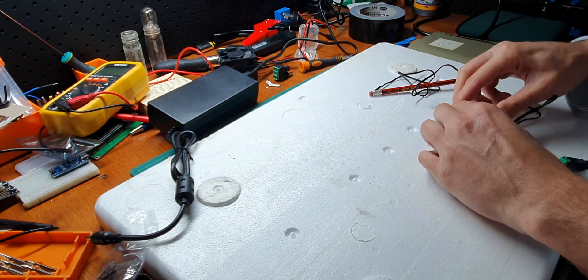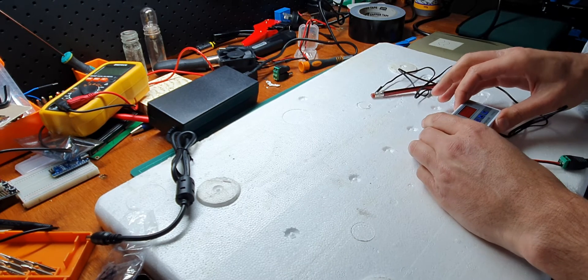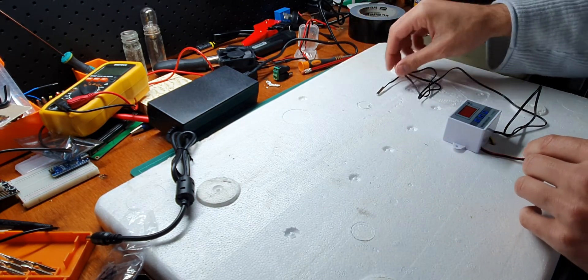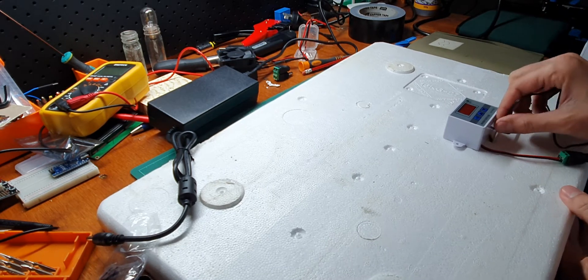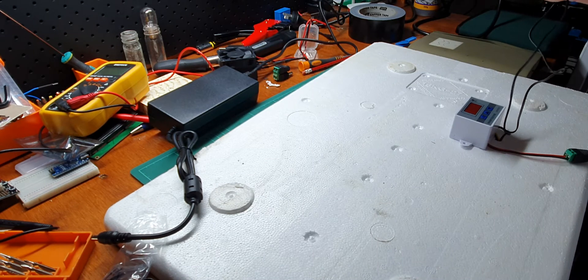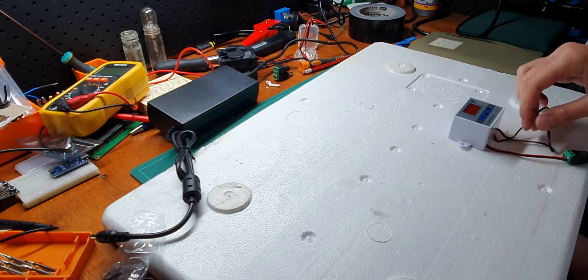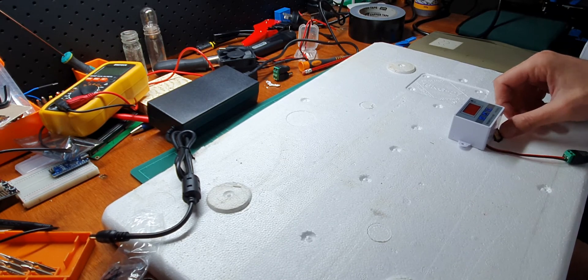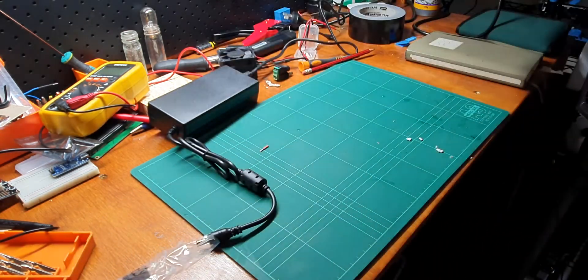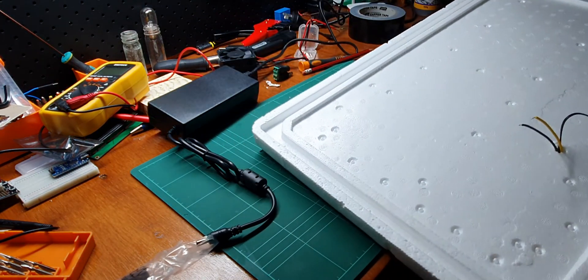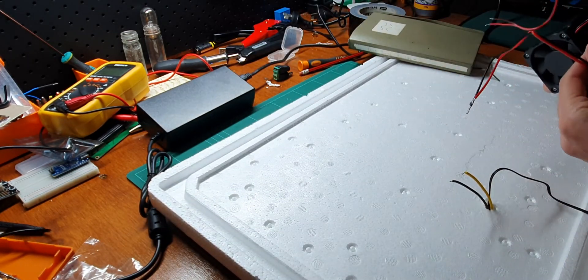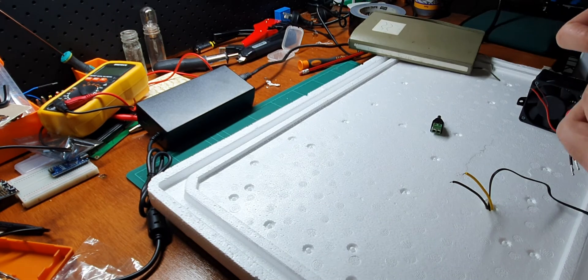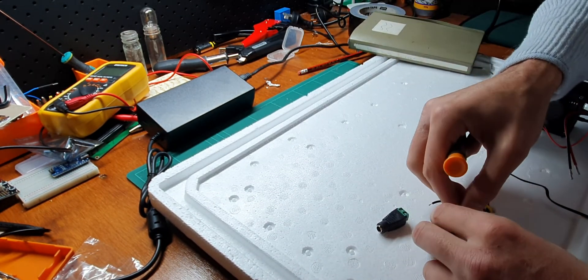Now if you're paying attention you might have noticed that I do have Arduinos and other microcontrollers sitting around my bench. I also have relays, so I basically have everything I need already to have made an incubator. But I was really interested in seeing how cheap I could actually build an incubator for, and so at $38 this actually comes in pretty under what it might cost to buy something like an Arduino, relays, the tools needed maybe some strippers, a soldering iron, all that kind of stuff. So the goal here was to just come up with something that was almost plug-and-play minus obviously the connectors and the duct tape.